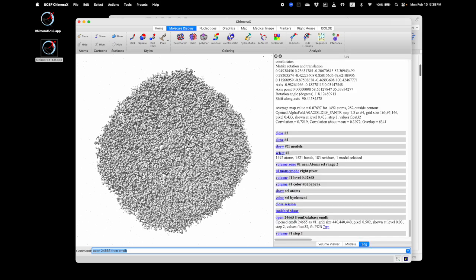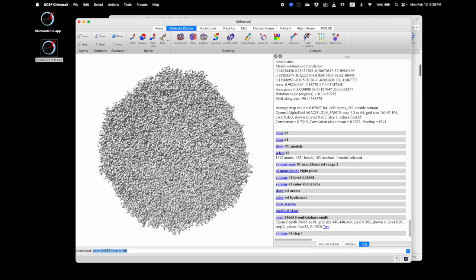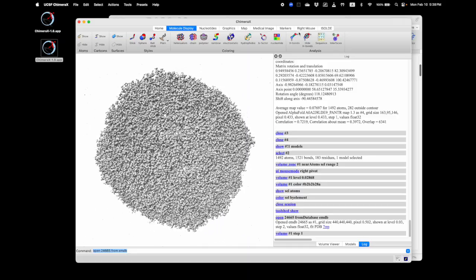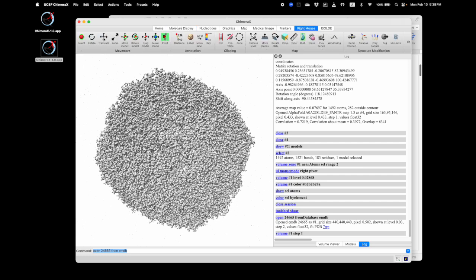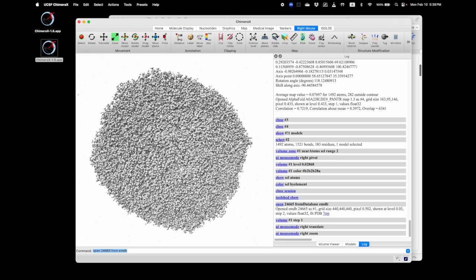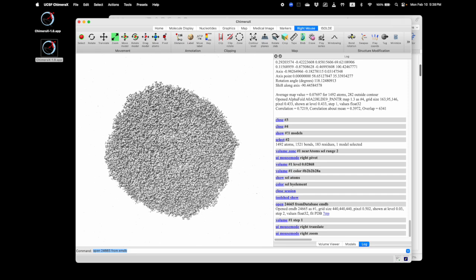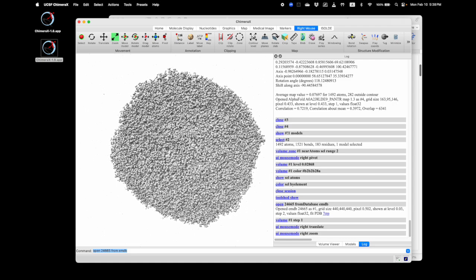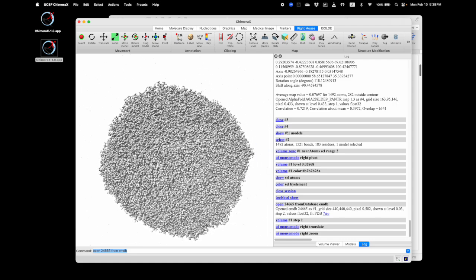and then they can be accessed with the tabs at the bottom. Okay, in ChimeraX, the left mouse button rotates the map and we can set, for example, right mouse mode to translate or to zoom. With a mouse, you can zoom with the wheel as well. And I have a 3-button mouse, so I have the middle mouse button to pan.